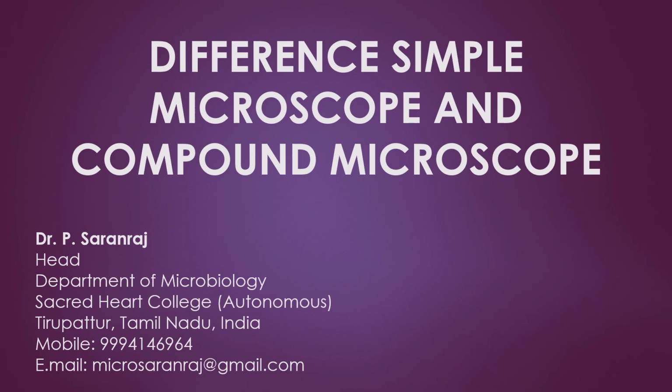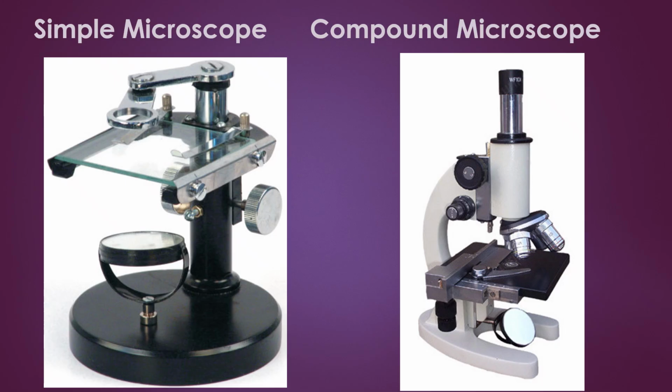Dear viewers, greetings. In this video, we are going to see the difference between the simple microscope and the compound microscope. These are the images of a simple microscope and the compound microscope.